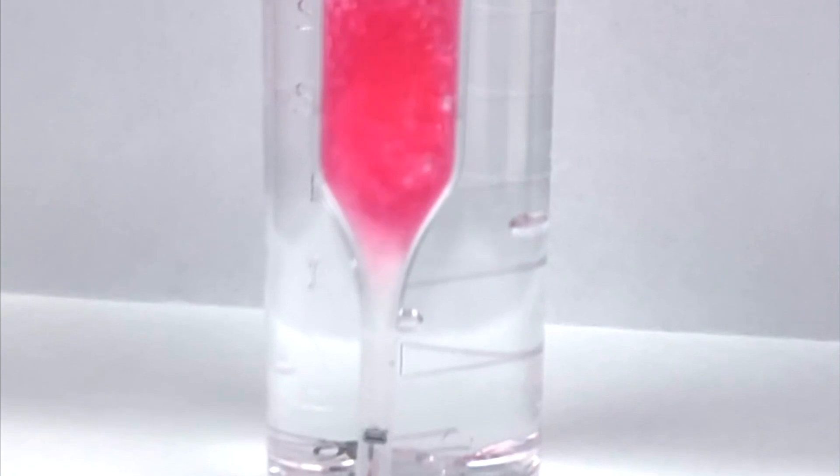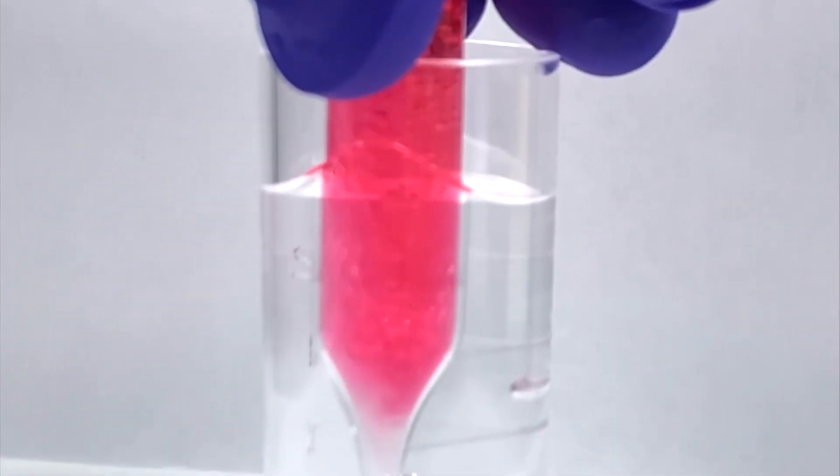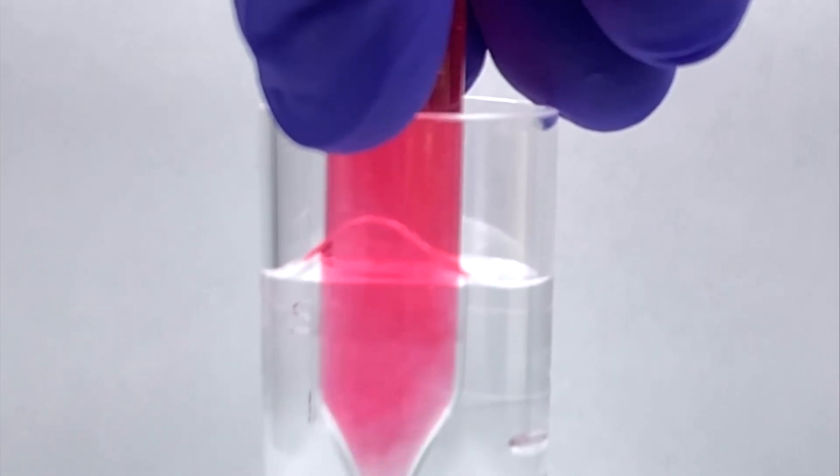Immediately after the snap, the vacuum sealed ampoule will draw in the precise amount of sample that's needed to mix with the pre-measured chemical reagents within.